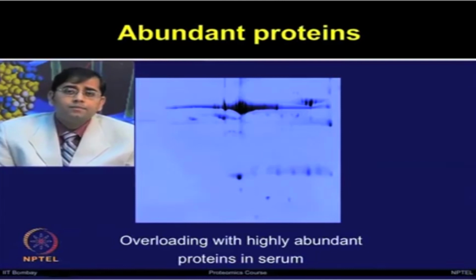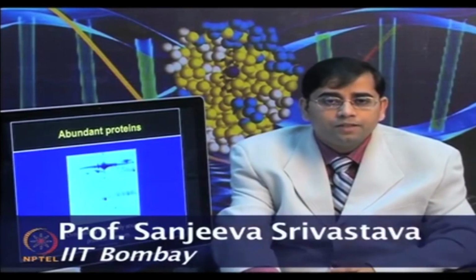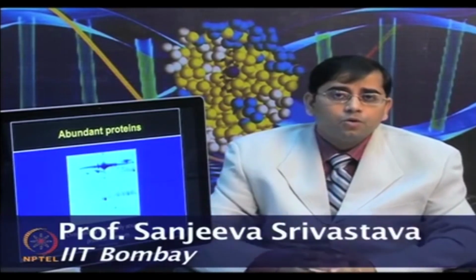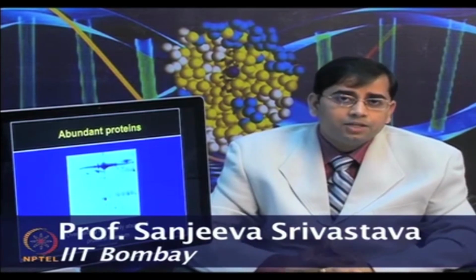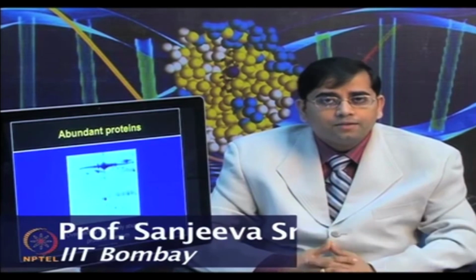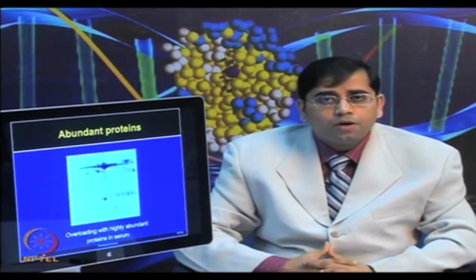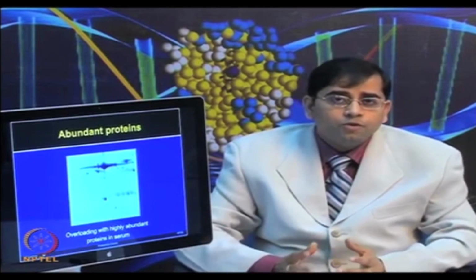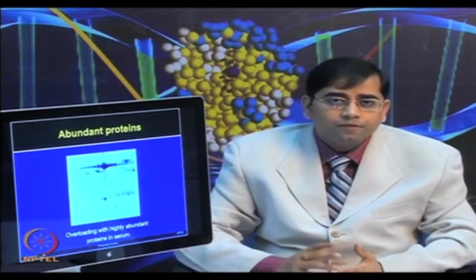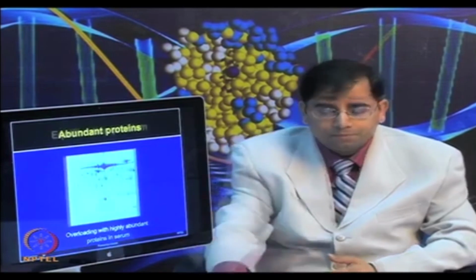In this gel, it is shown that human serum contains highly abundant proteins, which are visible in this area. There are various ways one can overcome these limitations, and in the previous class on protein extraction and sample preparation, we talked about how to remove the highly abundant proteins. So, please refer to that lecture.